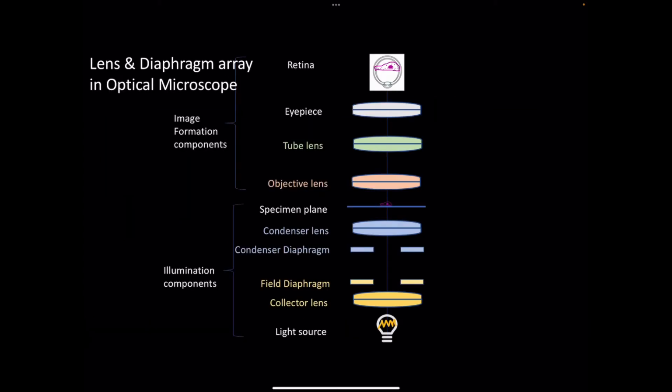So here in this presentation, you can see a source of light in the form of a bulb. I'm simplifying this in the form of a bulb and showing a filament here. I'm showing this filament deliberately to show that there is a certain structure to the light source, which you can see is non-uniform.